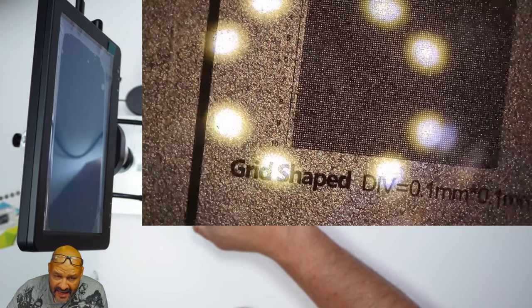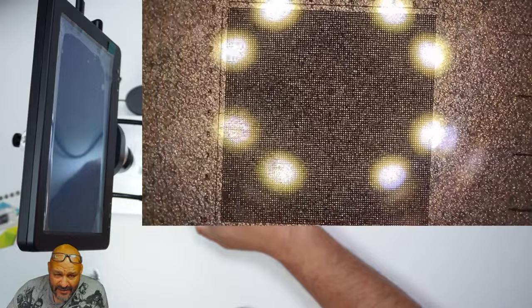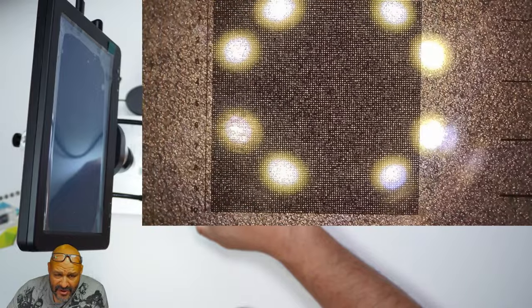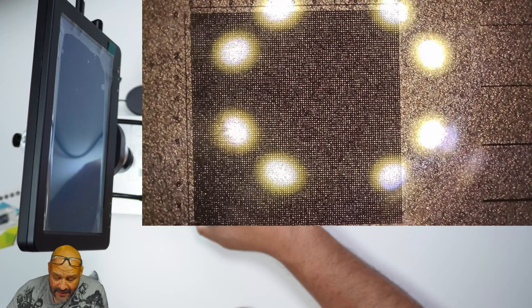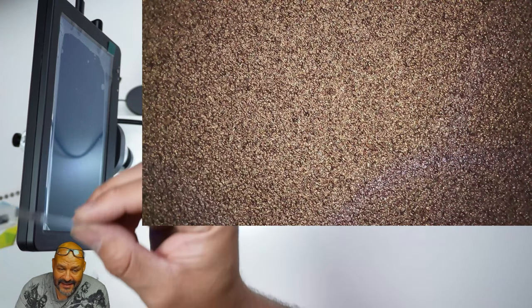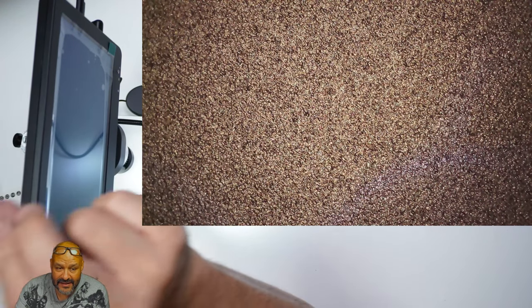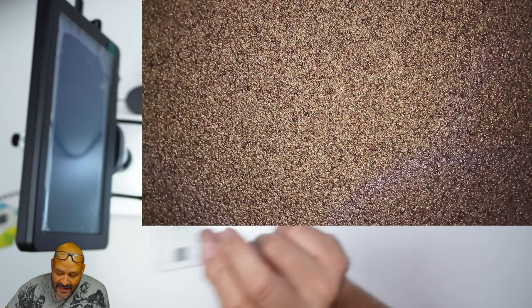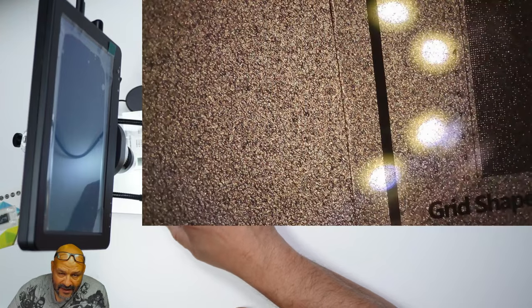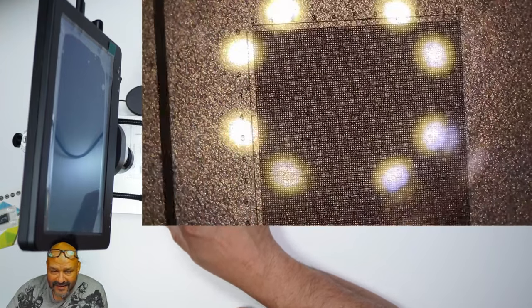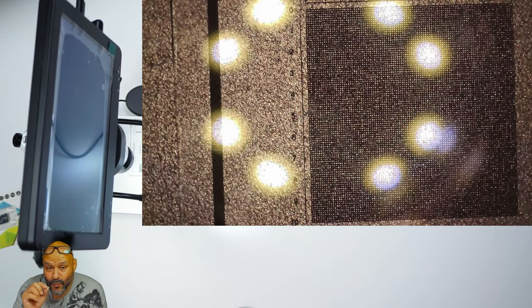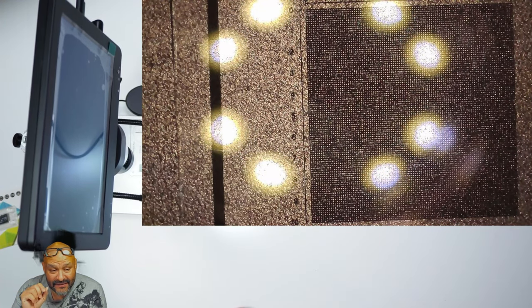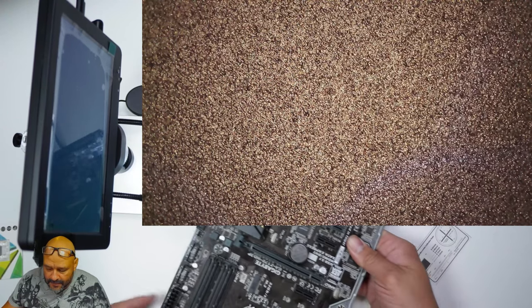You can see thousands of little details. This is just the demo that comes with it, a little see-through demo so you guys can see how microscopic you can see this stuff. Look how small. I'm going to put it here so you guys can see it on the window, and then I'm going to put it right back where it was. We're going to test it out. Look how tiny. You can see the really microscopic cubes that it has in there.